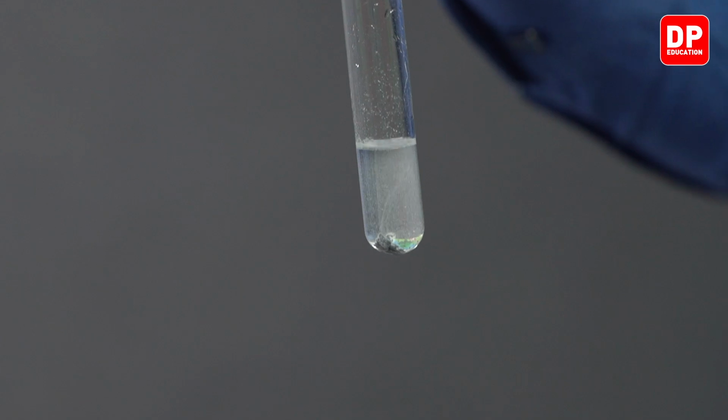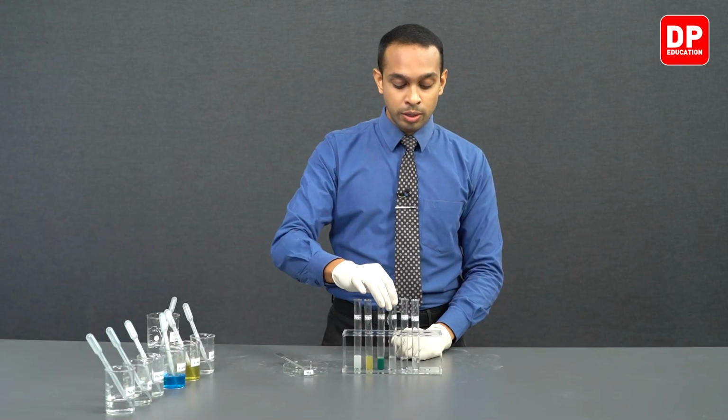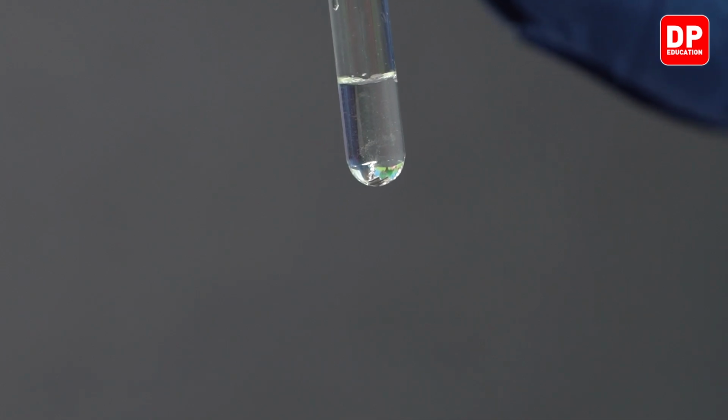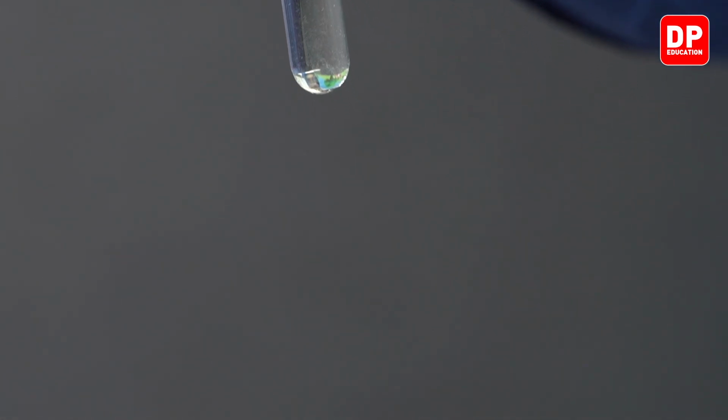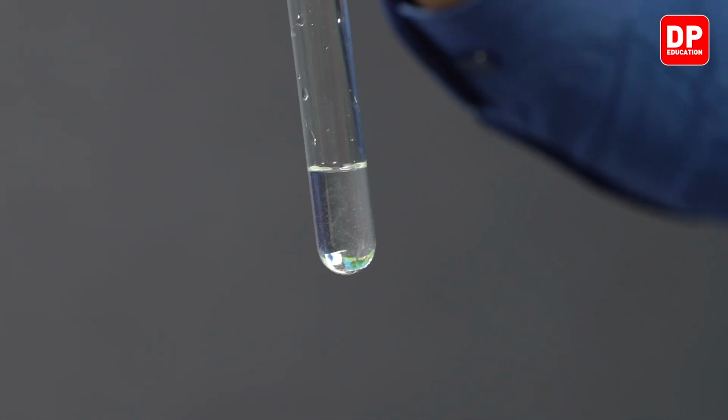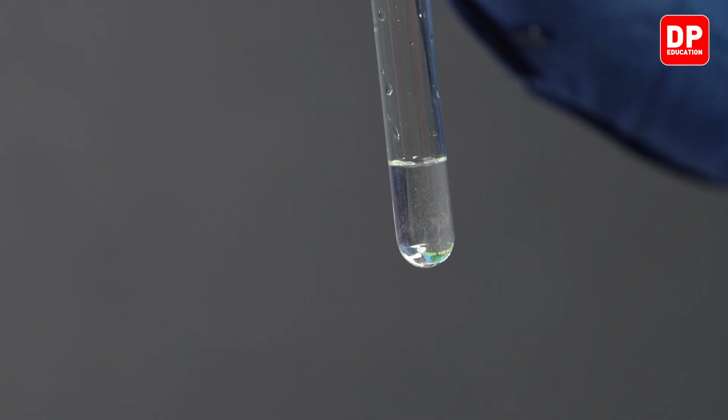But when it comes to a few other solutions, for example, if you take magnesium 2 plus ions added with magnesium, you would not see a reaction other than hydrogen being formed when magnesium reacts with water, because magnesium cannot react with magnesium 2 plus ions and displace them. So you don't see a reaction here.